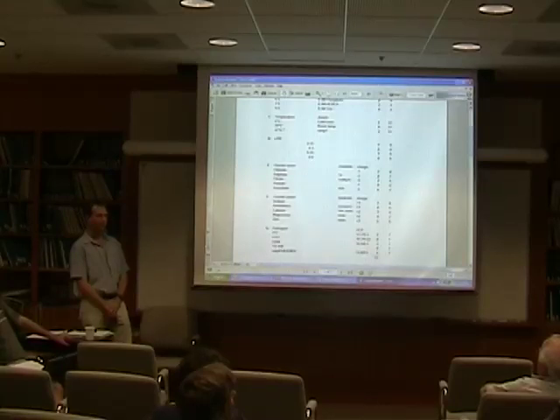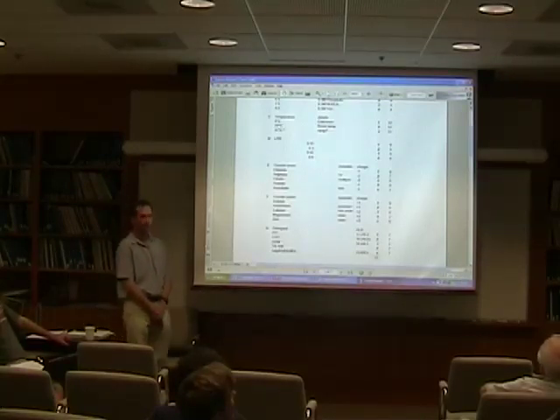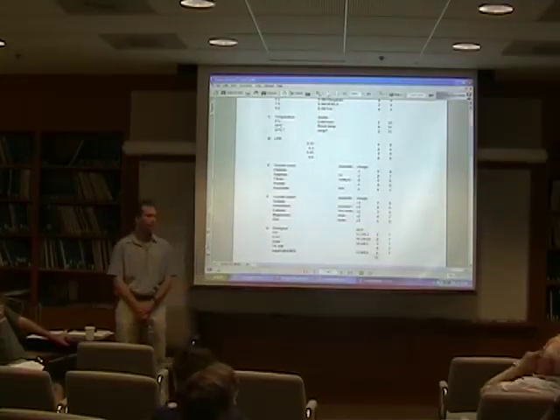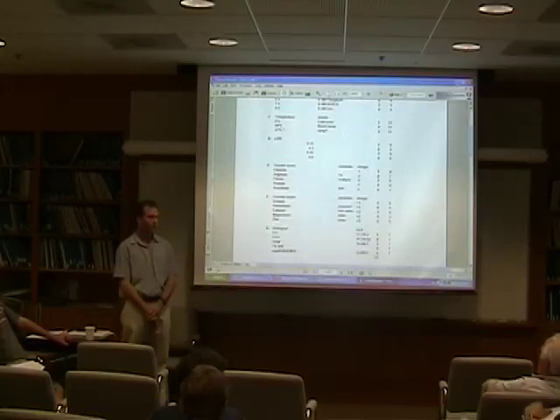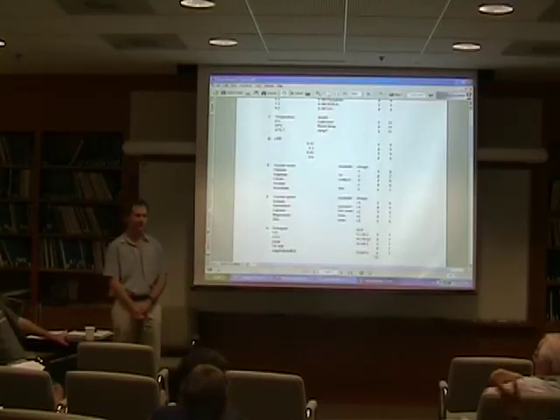But that amount that you can see using silver stain? Yeah, what you can see on an SDS gel, silver for example. Well, if it's recombinant, you can also use a histidine antibody or something. Yeah, Western. And you don't need the electron microscope for that. And that saves time. Yeah, you can use the microscope later, but that saves time. You can use the microscope while you're spinning. If you get more and good samples, you need an electron microscope afterwards.